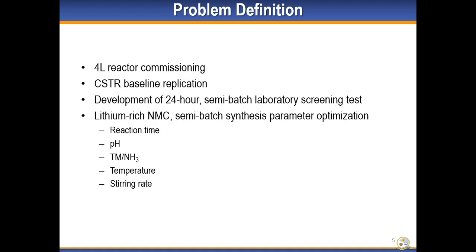With regards to the problem definition, we are commissioning a 4-liter reactor system. We are using a CSTR, or continuously stirred tank reactor, as the baseline to develop a 24-hour semi-batch laboratory screening test. Lithium-rich NMCs are synthesized via semi-batch mode, and optimization of reaction time, pH, transition metal to ammonia ratio, temperature, and stirring rate are investigated.